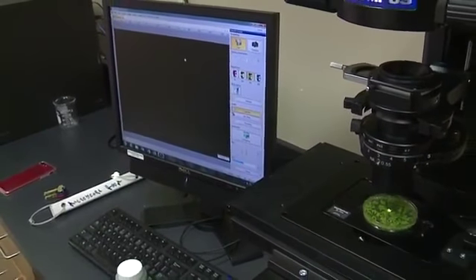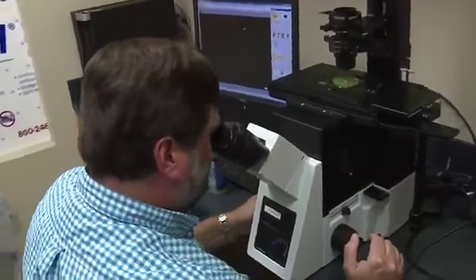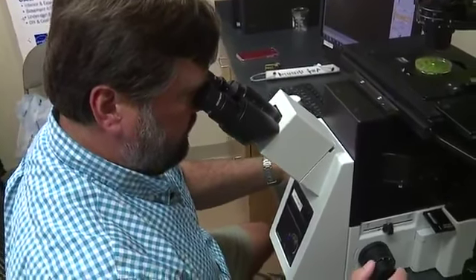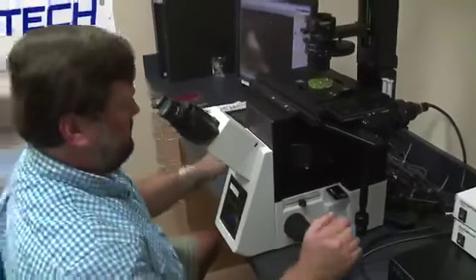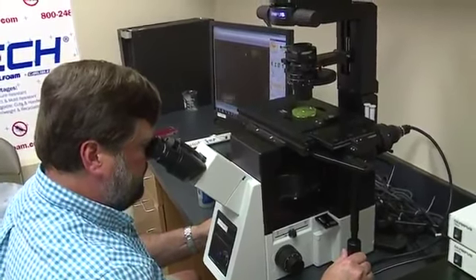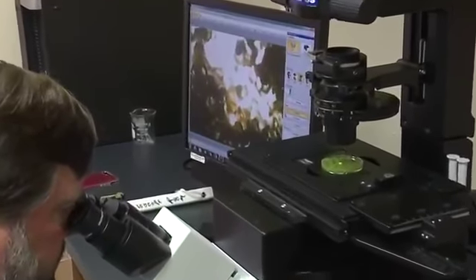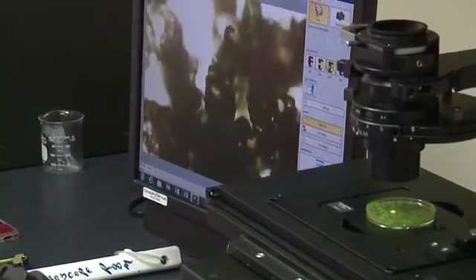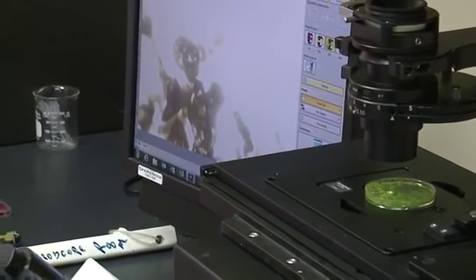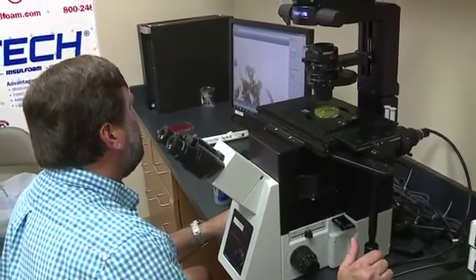All right. So I need to get this in focus. Yeah, and you can definitely smell it. And it pops up on the computer there. That's really cool. Yeah, so you can see these big clumps in here. I wonder if I can zoom even farther back. Wow. And so these are, it's really thick. Let me see if I can change the settings. I don't know if it's going to let me do automatic or not.